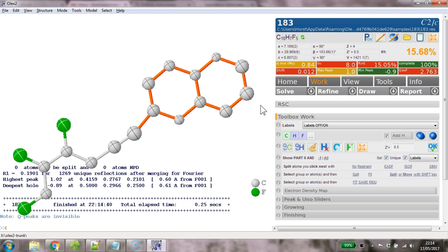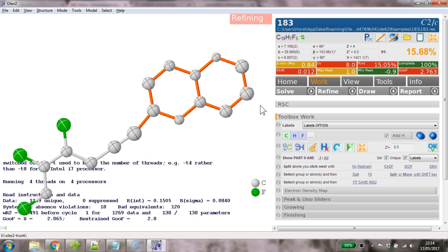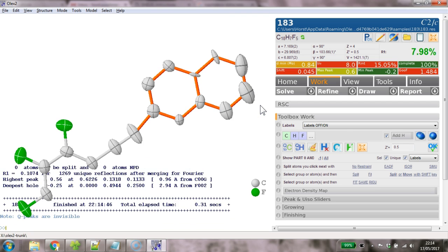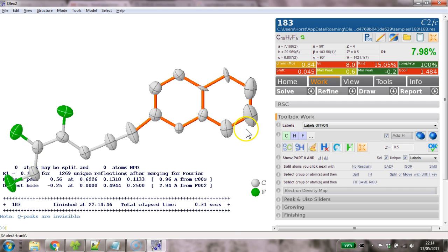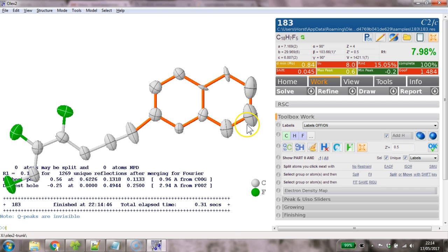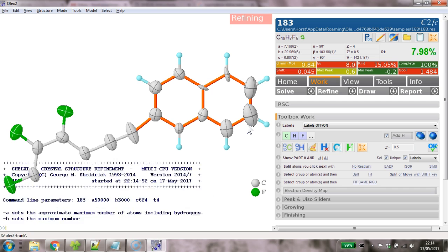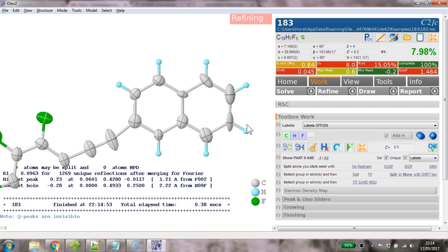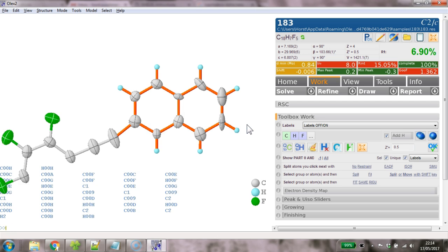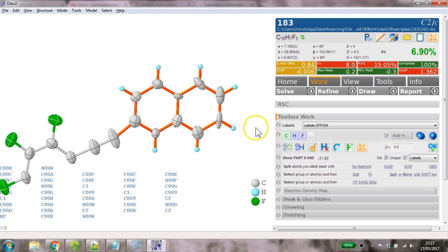We go anisotropic on it, refine here and that looks not bad. We H add the hydrogens on here and this makes the PV view gone again. So PV again and let's go back to this view.